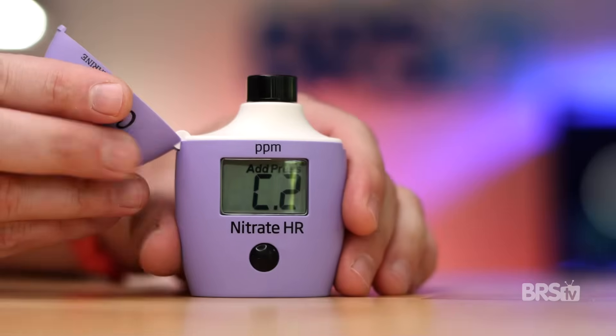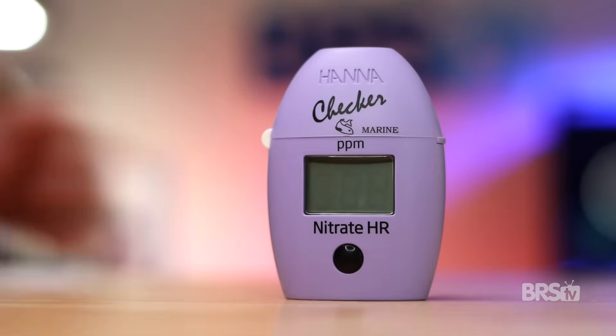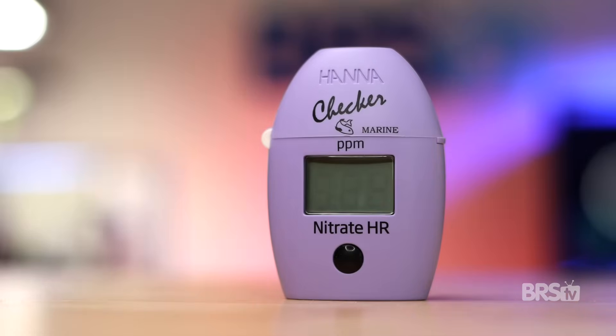Let me tell you another mistake I constantly make. Instead of pressing and holding the button until the seven-minute timer appears, I forget and just press the button really quickly. What happens is the nitrate checker will immediately read the results without waiting for the seven minutes, and the numbers will be inaccurate. If you also make this mistake, not to worry — you don't have to retest. The seven-minute timer is just a timer; the HANA checker doesn't actually do any testing during that seven minutes. It waits until the seven-minute timer is up, and then tests the water in the cuvette.